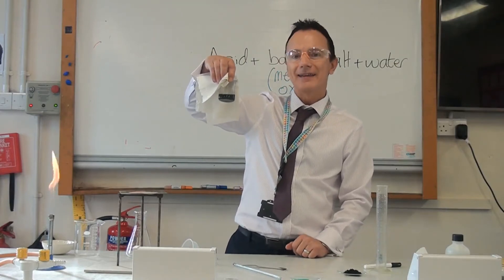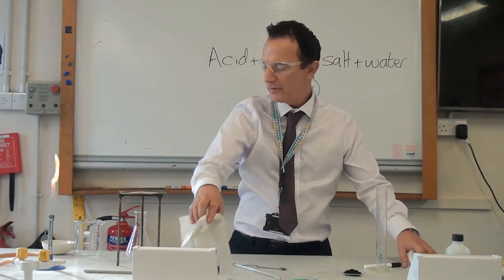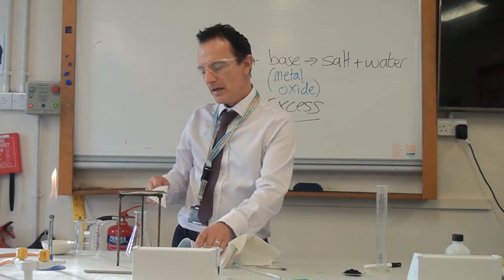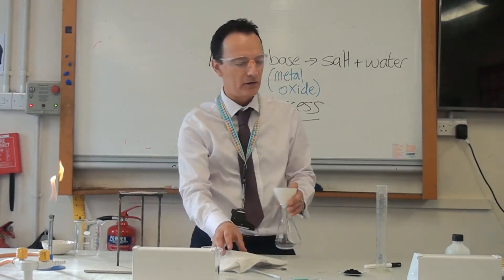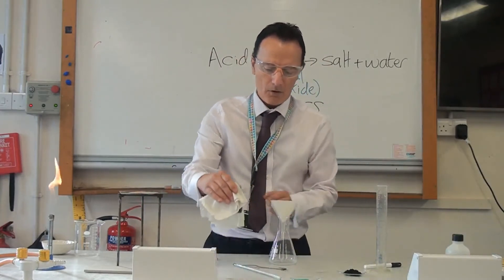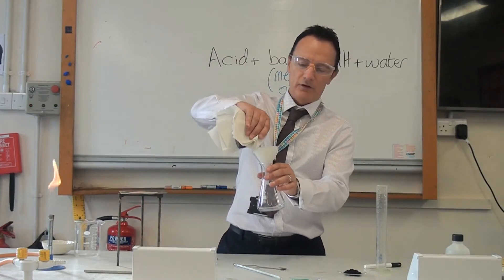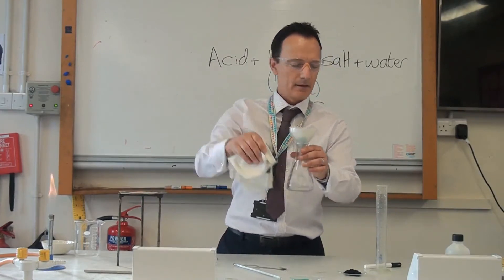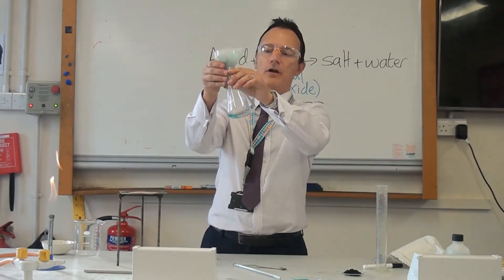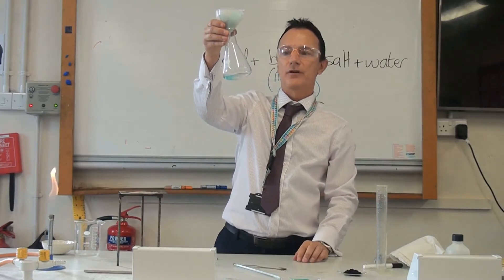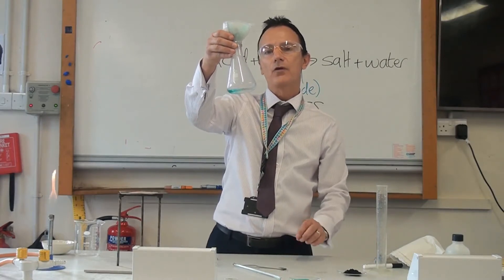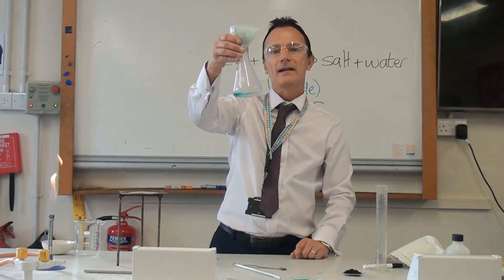Now we need to filter out that excess copper oxide. We do that with a filter funnel and filter paper. In an exam, mention the equipment you are going to use for this step. We pour the solution through the filter paper and we should start to see copper chloride filtering through. We will leave that filtering for a few moments and then come back to see how we get the pure dry salt from that copper chloride solution.